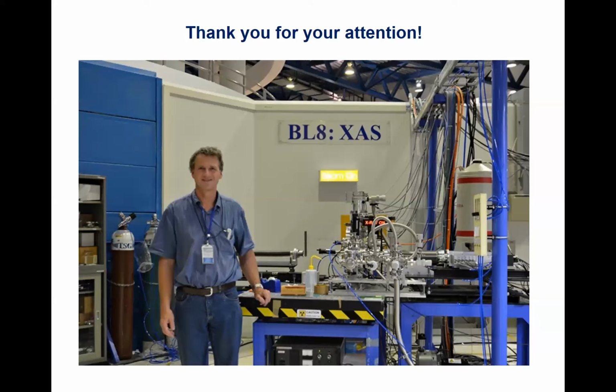You don't have to look at the white line and the post-edge. Maybe this is possible for different carbonates as well, in pure mixtures, but I haven't occupied myself with that at the moment. But it's a good idea for mineralogists and geologists maybe to do so. Thank you. Okay, thank you very much.